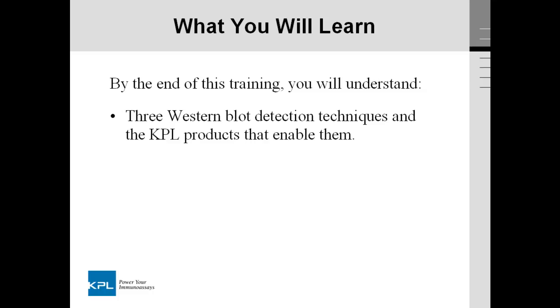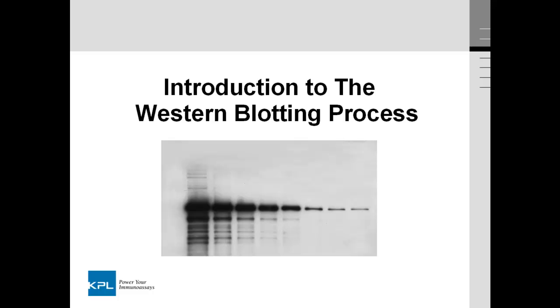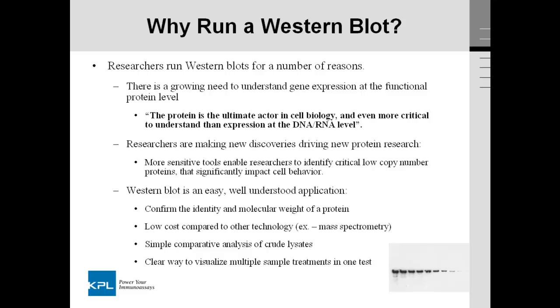By the end of this training, you will understand 3 different Western blot detection techniques and the KPL products that enable them. They will also help you to perform your high-performance Western blot. We will begin with an introduction to the Western blotting process. You may ask, why would someone need to run a Western blot?